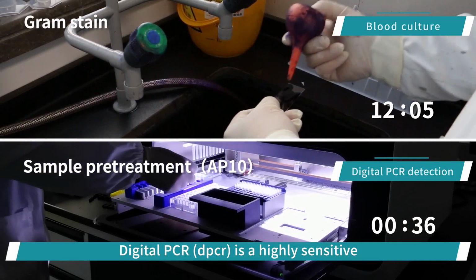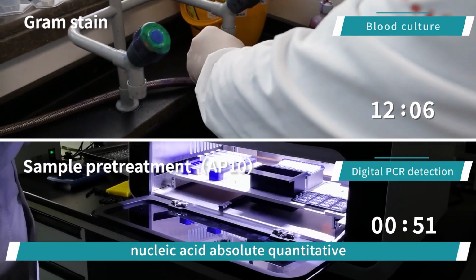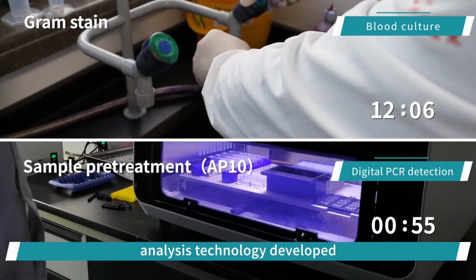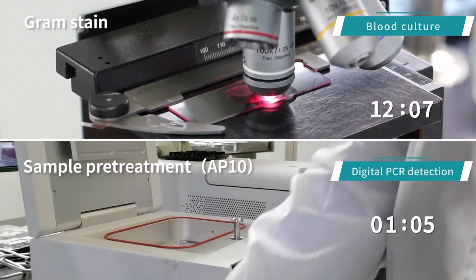Digital PCR is a highly sensitive nucleic acid absolute quantitative analysis technology developed after real-time quantitative PCR.